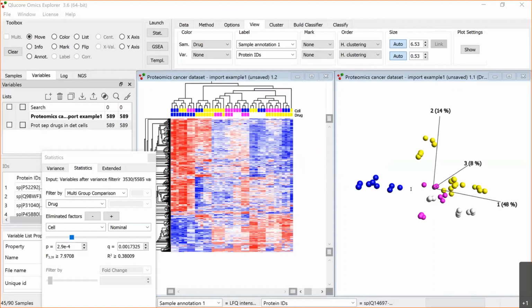And I also get a question here. Can you name some of the largest databases for proteomics? And are the data in TXT file always? On the top of my head, I can only name the PRIDE archive, which was the example we had. And no, you cannot trust that it's always TXT.